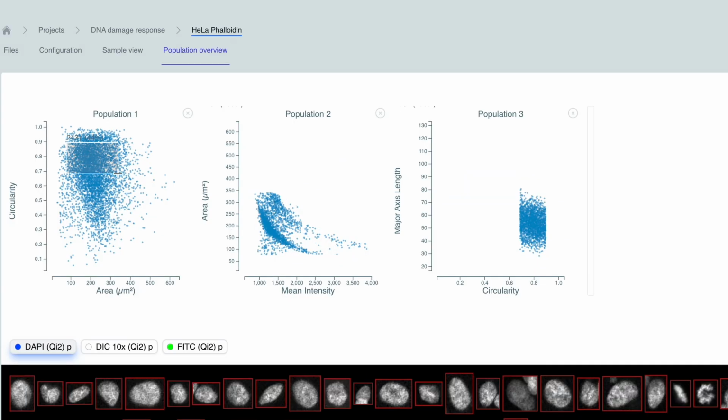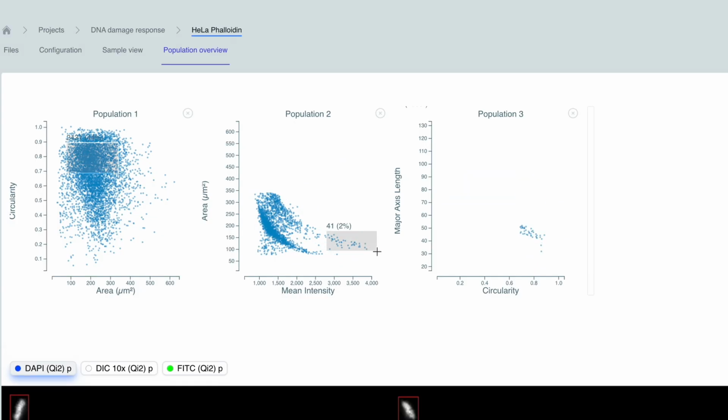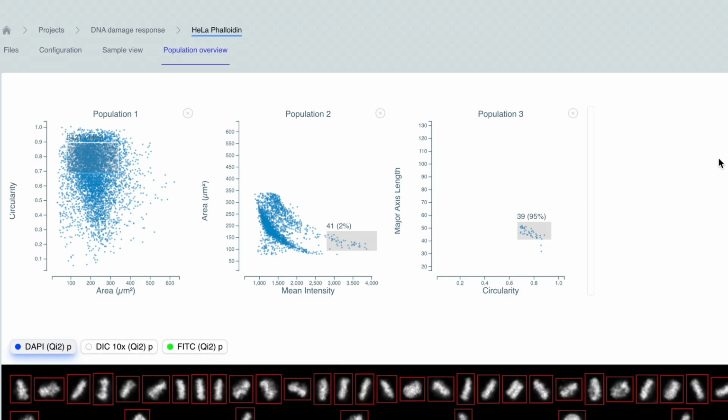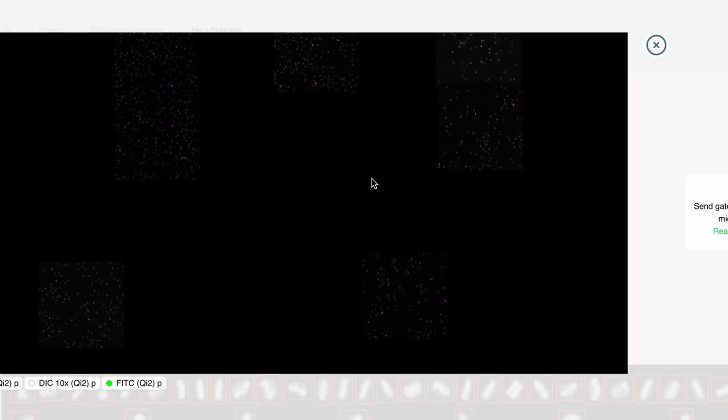That's a very clear recommendation. Thank you. Okay, Kalle, do you have anything you want to add? I was just a little bit curious, perhaps, about the data-driven acquisition, where you select a certain population and then use that to image cells at perhaps a higher magnification. I was just curious, what has your experience with that been? Have you used it much?